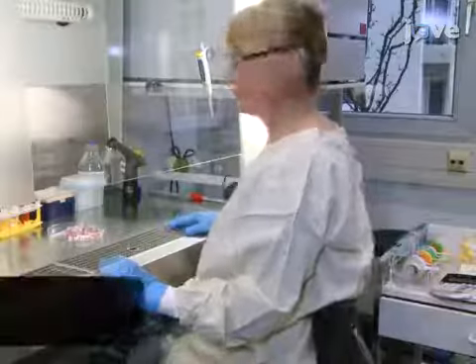replicate. Generally, individuals new to this method will struggle because each step of the experimental procedure, from the preparation of HEK cells to the recording of photocurrents, has to be optimized. Seeding and transfection of the HEK cells will be demonstrated by Altina Klein.